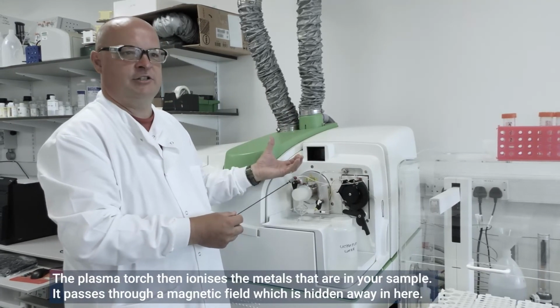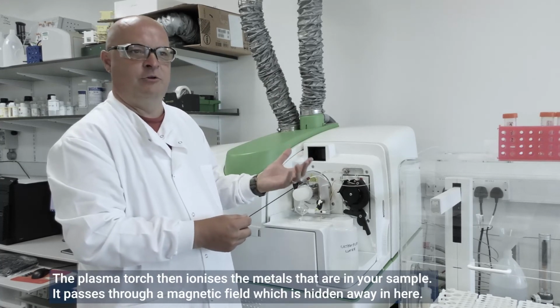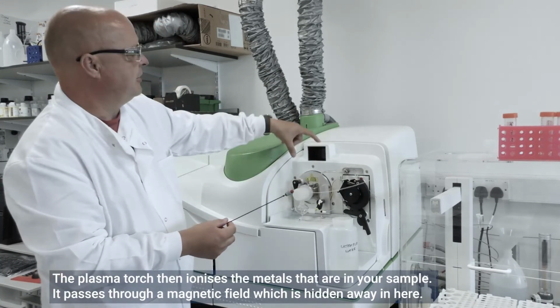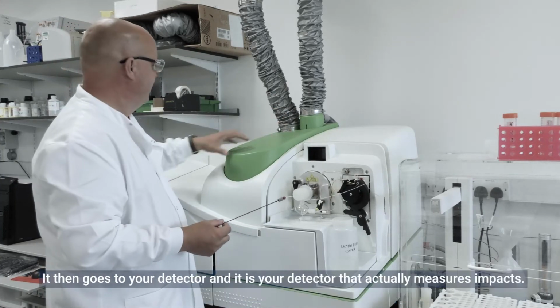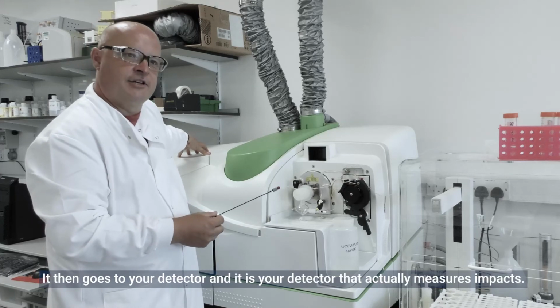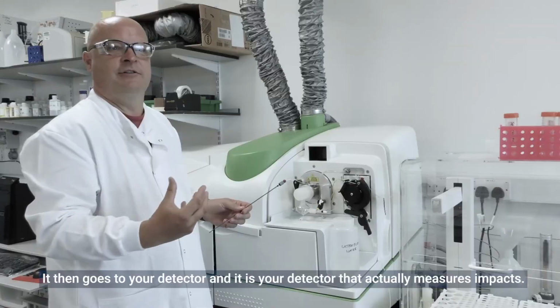The plasma torch ionises the metals that are in your sample. It passes through a magnetic field, which is hidden away in here. It then goes to your detector, and it's your detector that actually measures impacts.